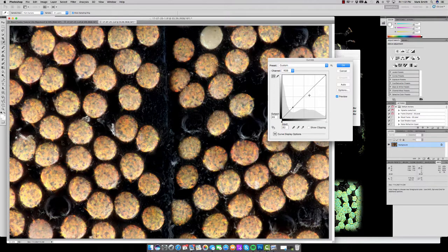So typically you would want to brighten an image like this all around. So instead of actually moving this corner down here and this corner up here, which you can see how it kind of oversaturates the image, do the inverse, where you take the underside and then the upper side, and now you're trying to pull out, and you can see how much more the detail and the structure of each scale really shines and pops out at you.